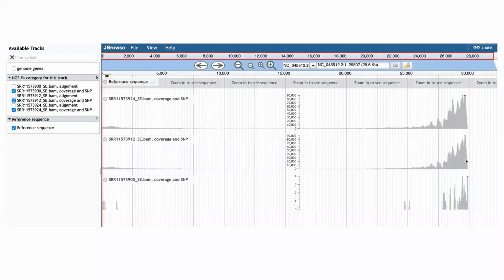Okay, so what is your interpretation from what you see? Okay, we have 3 files. Okay, which one does not have that virus present in a sample? Which sample does not have the coronavirus in it? Okay, I'll let everybody answer that question.